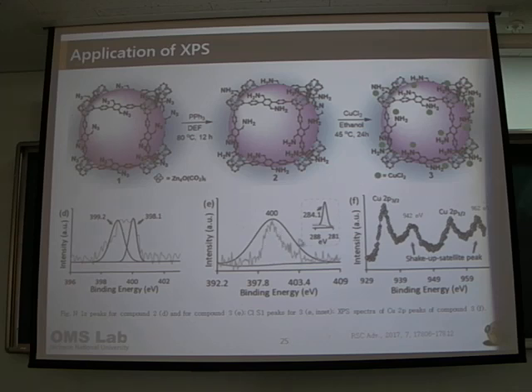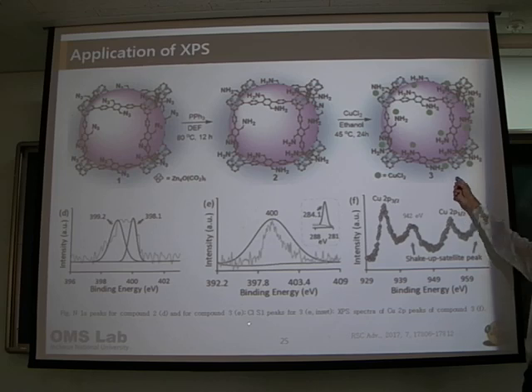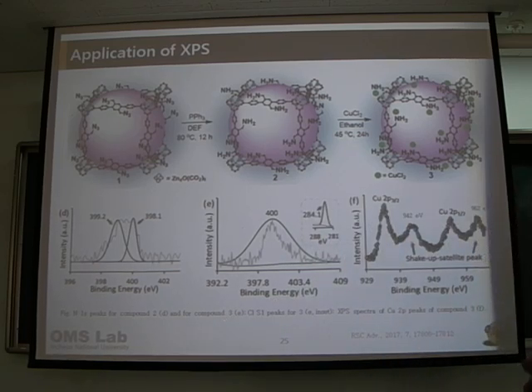Yeah. I see. It says chloride, where? This number E, this one is 3, that means this compound. Chloride is the insert, and look here, this is compound 3. So this is the nitrogen peak of this coordinated one. The small thing inside is the chloride. And this is chloride? Yes. And this is nitrogen. Yes. And what about the copper?